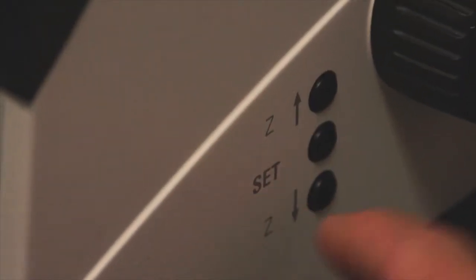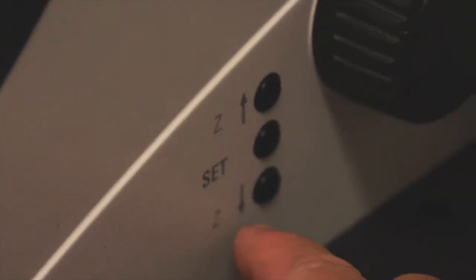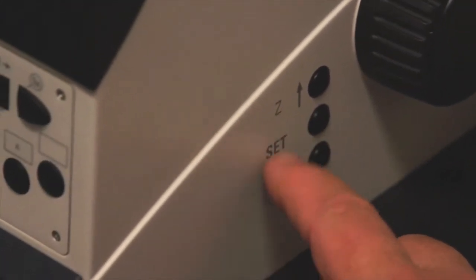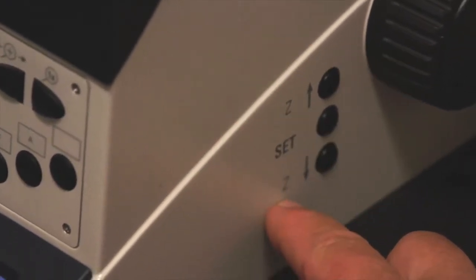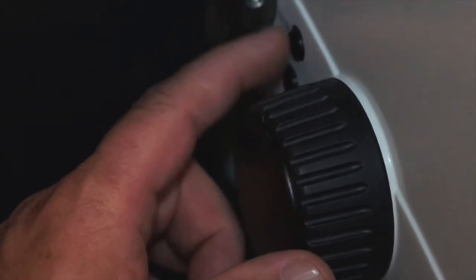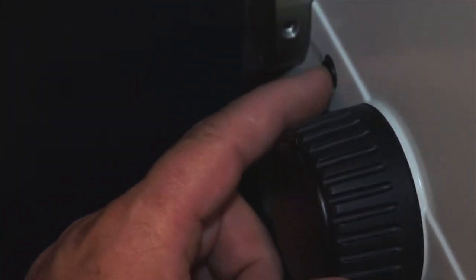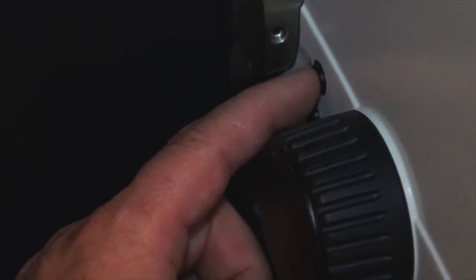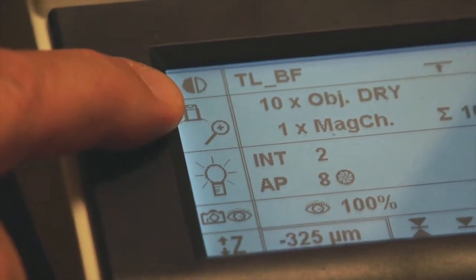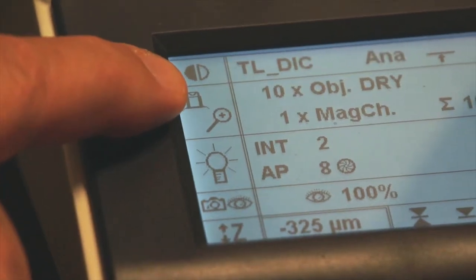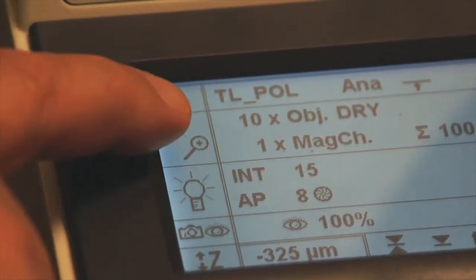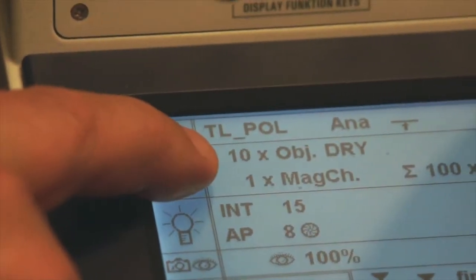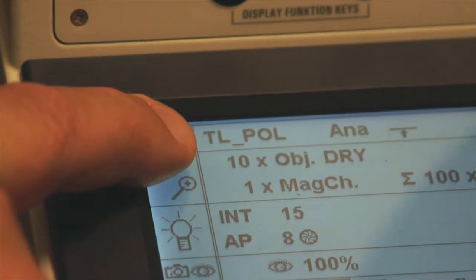You can also go from scan mode back to direct observation through the microscope by pushing that bottom button. On the right side of the instrument, just outside the focus knob, are three important buttons that have to do with setting the Z axis up and down position. Please do not touch these buttons as this has already been set by the technician. By pushing the top button, you're toggling between the different transmitted light illumination methods, and you can see this on the screen — the top line shows your current mode such as bright field, DIC, or polarized light.